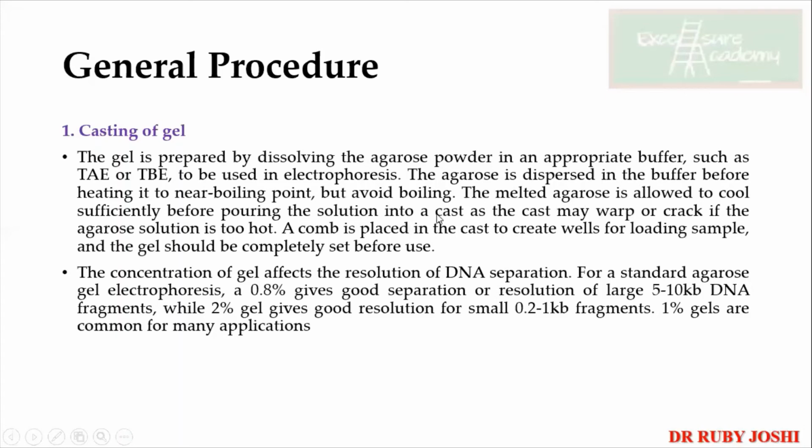The agarose is dispersed in the buffer before heating near the boiling point. Avoid boiling. See, अब boiling में क्या होगा? आपका bubble formation होगा. Now, in the case of gel, this is also important, okay? For example, you have made the gel, and during the heating, the bubbling was there, and this bubbling will get trapped during the solidification. अब अगर सोचो तुम्हारा एक जेल है जिसमें बीच बीच में बबल्स बने हुए हैं और ये सॉलिडिफाई हो गया है, do you think it is going to affect the running of your DNA?